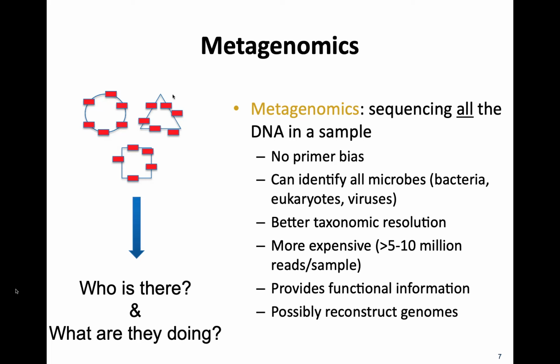And there's something else around that. Some people have sort of dabbled, I guess, with shallow shotgun sequencing. It's something you might have heard about. Shallow shotgun sequencing typically would be maybe in the range of 1 million reads or less, seems to be the definition around that. And so that sort of became popular.